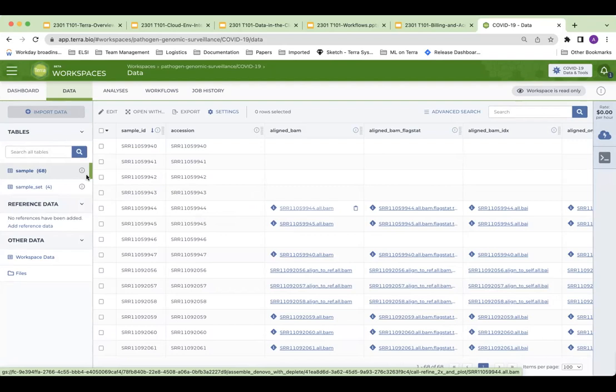Okay. Yeah. I have a question. So the data that goes into these tables, do they have to have a certain format, or are they free format? So on the back end, this table is just a CSV. And that's actually part of the demonstration later on: I can download this entire table, open it in a spreadsheet editor, and modify it however I want.